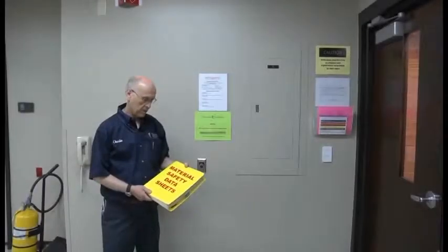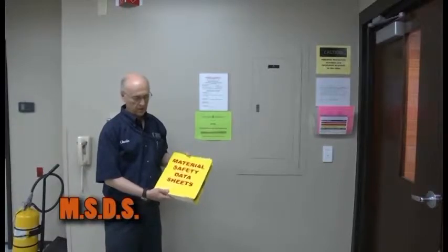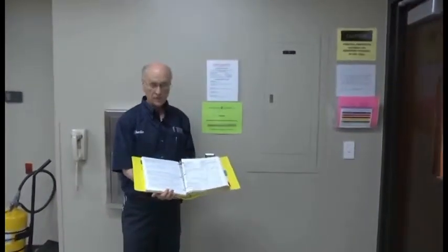Okay, we're going to be talking about MSDS's, material safety data sheets. This happens to be one of the books that we have on campus, and I'll talk briefly about what a material safety data sheet is, but this is all in here. A material safety data sheet, you can even find it in any of your household products.